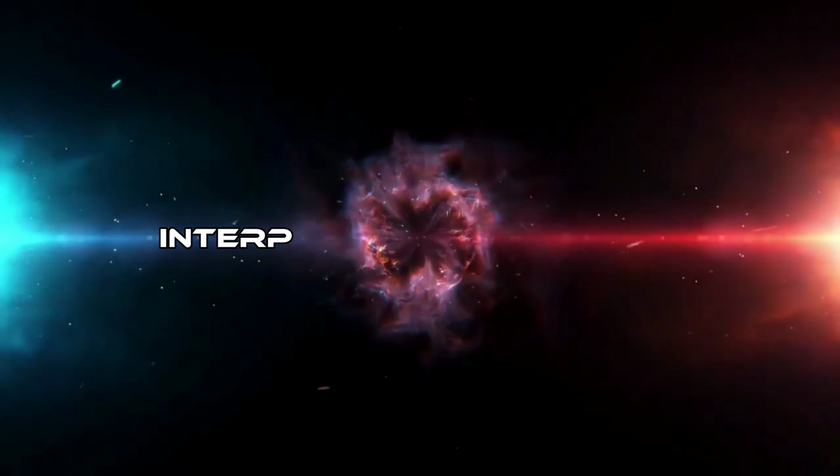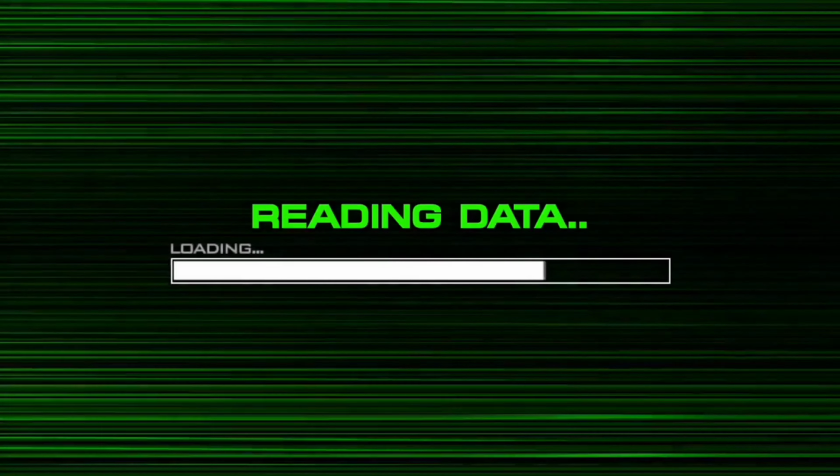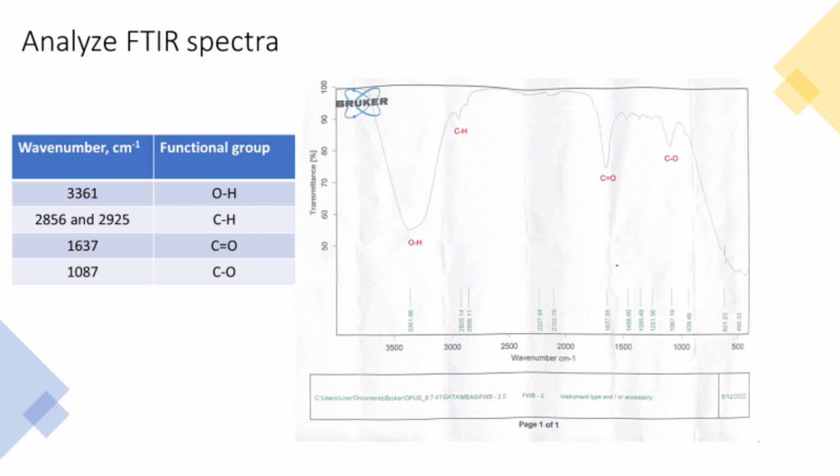Next, I will explain how to read an infrared spectroscopy spectrum. These are the peaks in the FTIR spectrum of the unknown liquid sample that we observe. Firstly, the functional group that we observe was probably OH stretching at wave number 3361.